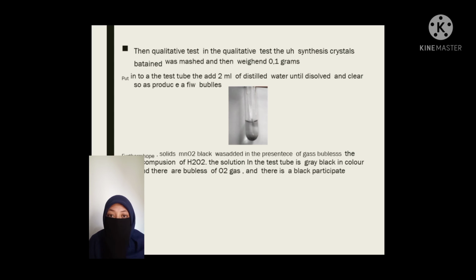Okay, the qualitative test. In the qualitative test, the UHP synthesis crystal was weighed at 0.1 grams and put into a test tube.